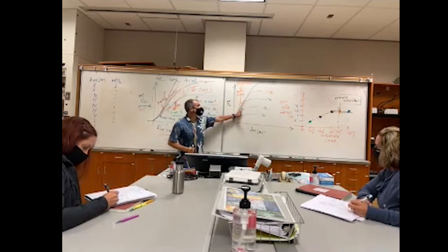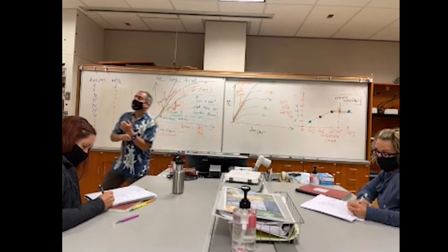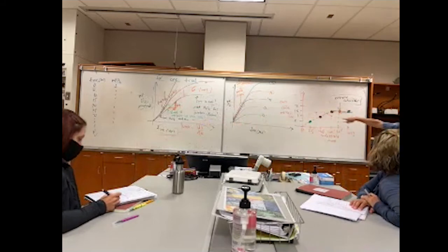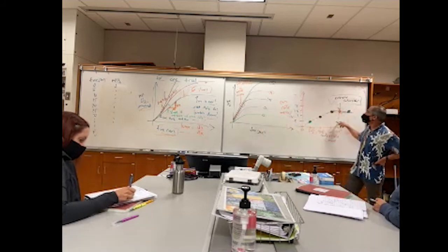If the slope keeps getting faster with higher concentrations of substrate, then we're not at saturation yet. If you start increasing the concentration, but the slope doesn't get any steeper, the rate isn't getting any faster. But I also want you all to try to see the relationship between... You're going to have to make these graphs to make this graph.